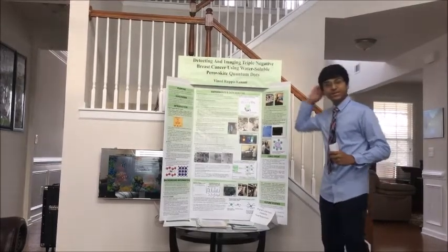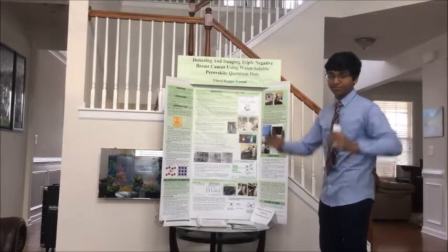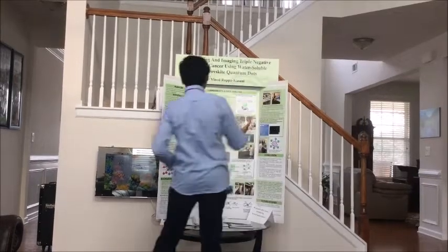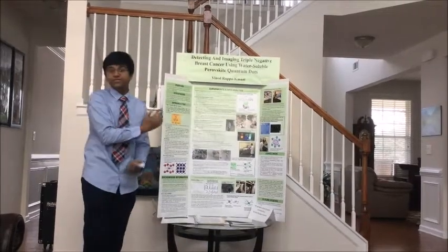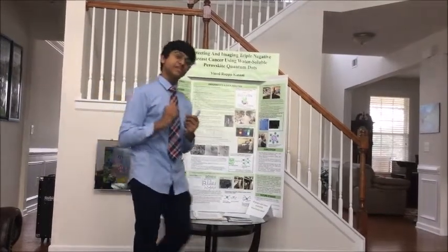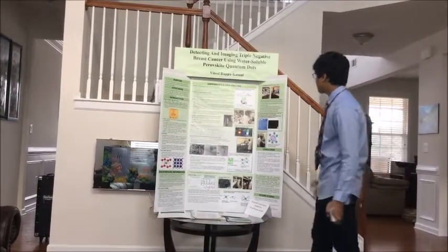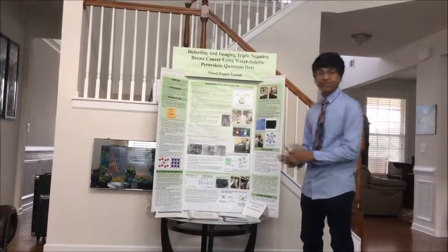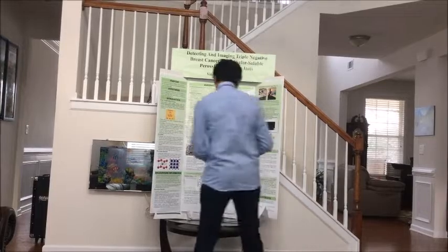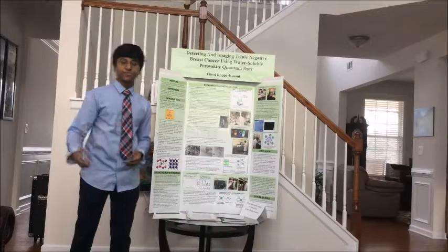And that's seen in this picture here. You can see in picture B how all the perovskite quantum dots crowded around the exosome, and it gave a very bright green luminescence. And this is just a luminescence microscope image. This isn't any sort of TEM image, and it shows how bright the luminescence of the perovskite material actually is. And in picture A, you can see how the perovskite material really crowded around the exosomes, and you can see the different spots there.